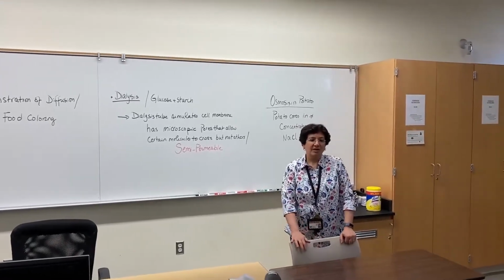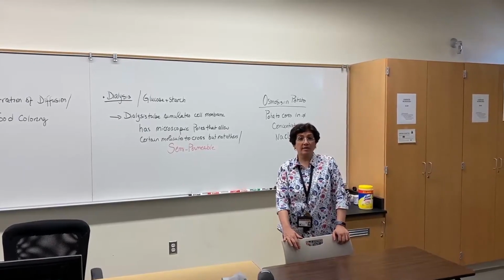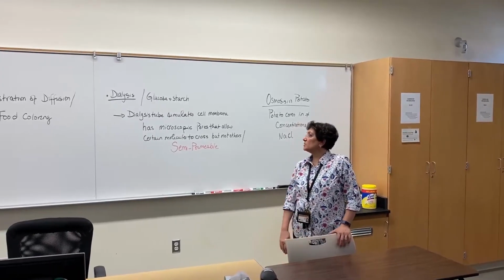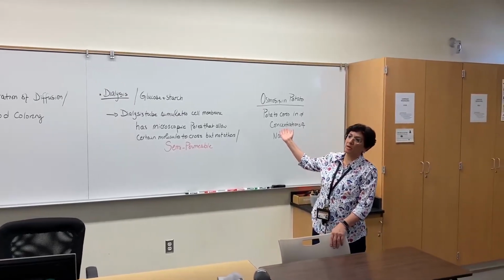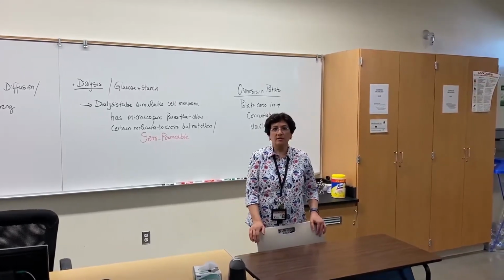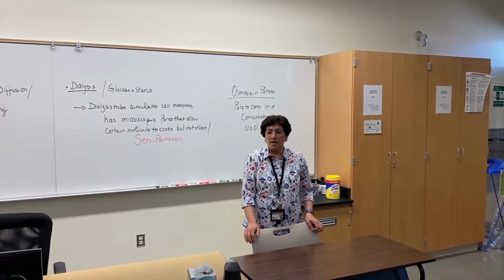Okay, well, today we are on exercise 4, and specifically we're going to be covering molecular transport. We're going to be talking about diffusion, we're going to be talking about dialysis, and then we're also going to be covering osmosis in potato plants. The plasmolysis part, please refer to your lab introduction, the video, refer to your lab manual.